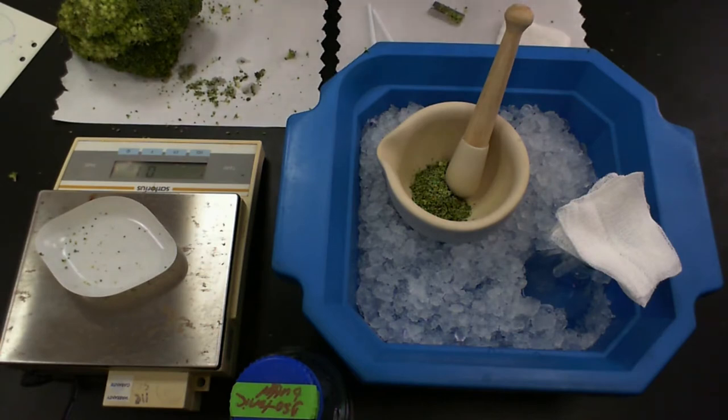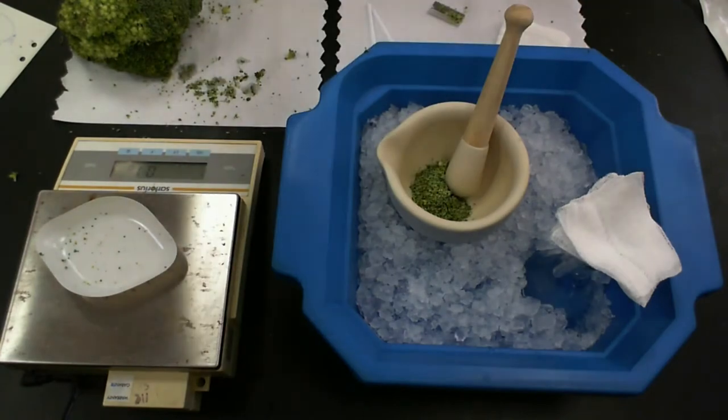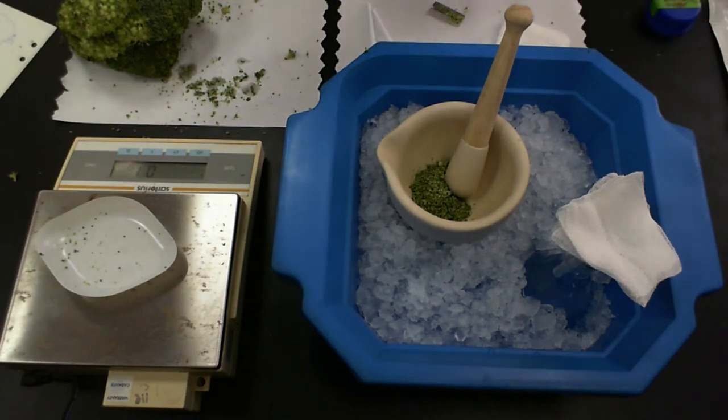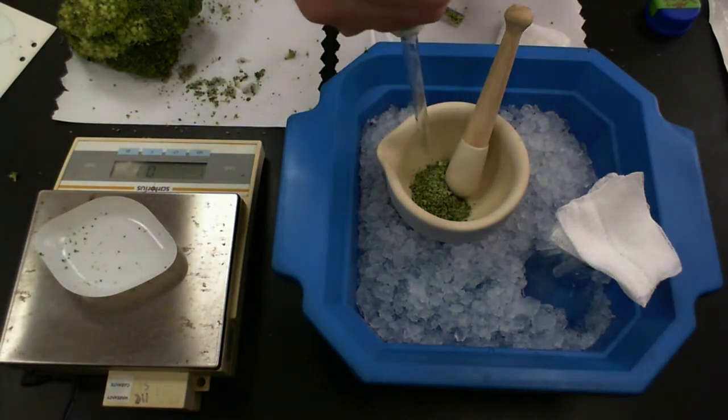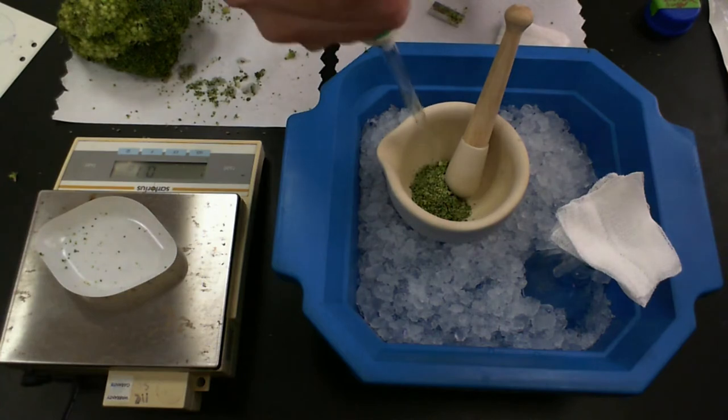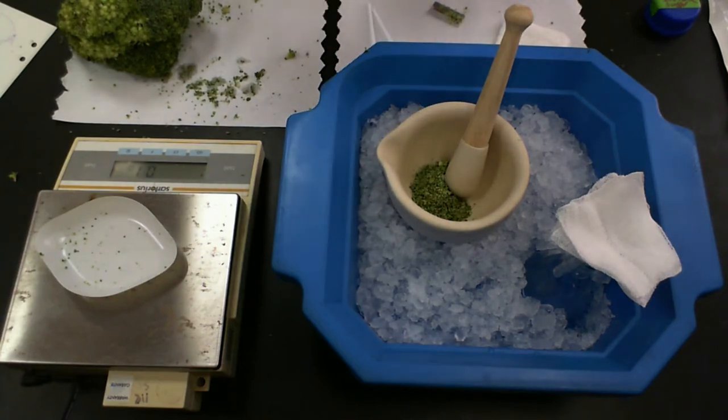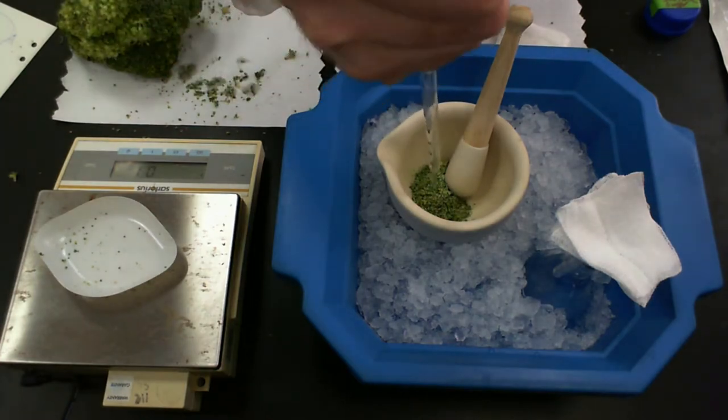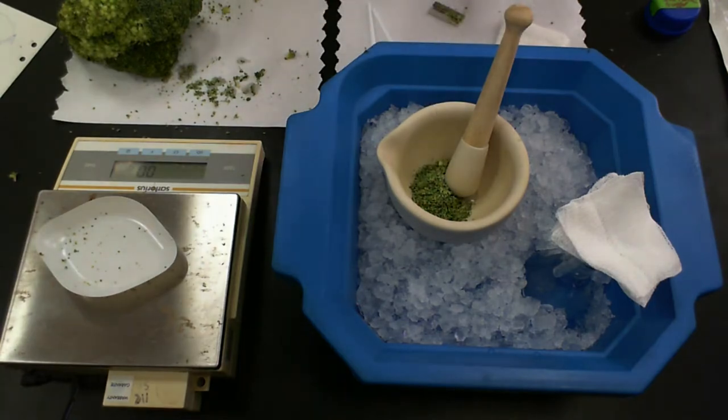And I can go ahead and add the appropriate volume of my buffer. So I have my isotonic buffer in here. I'm going to add initially just two milliliters, just so I have some liquid in there. Maybe a bit more. It's generally easier to work with smaller volumes initially, but I have a bit more tissue than I was expecting, so let's go with the full five.